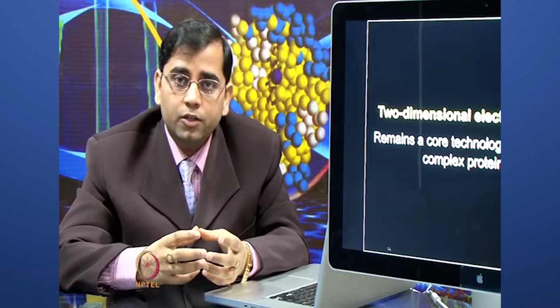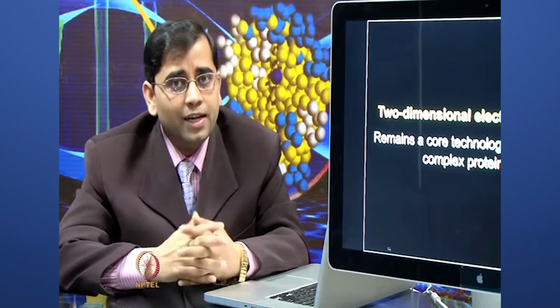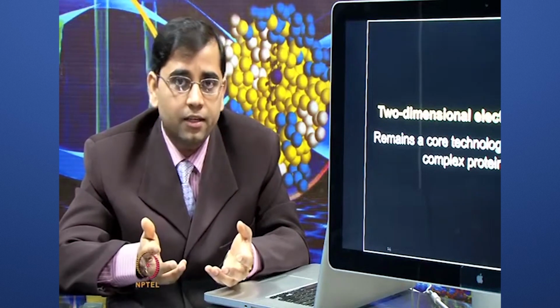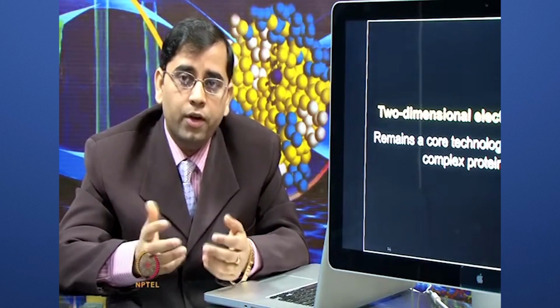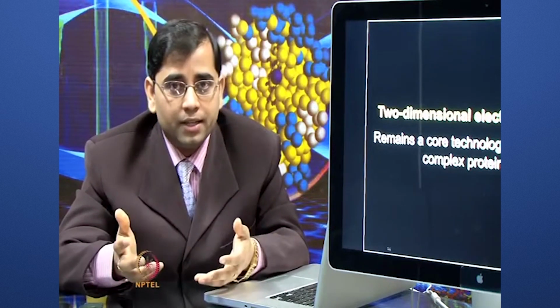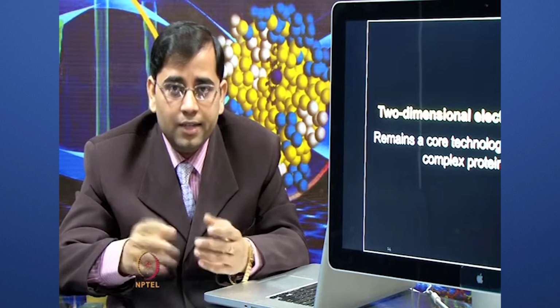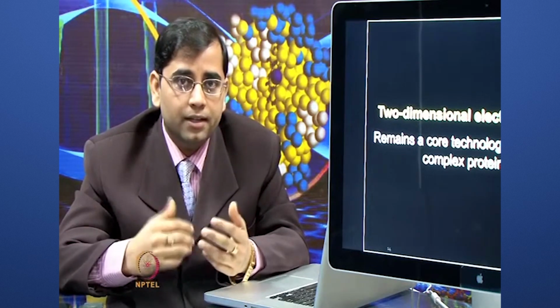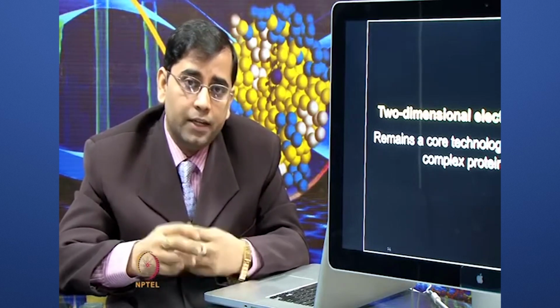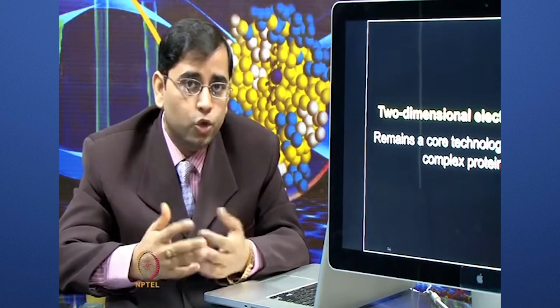But when people started comparing complex samples, complex proteomes, for example a clinical sample where you have to run maybe 20 patient samples and 20 healthy controls, in such a scenario, when you have to run a large number of gels, two-dimensional electrophoresis shows a lot of variations and reproducibility issues. Therefore, this technique started getting a lot of criticism, that there are reproducibility issues and some manual artifacts. Then there were some technical issues inherent to this concept in the beginning, like tube gel.